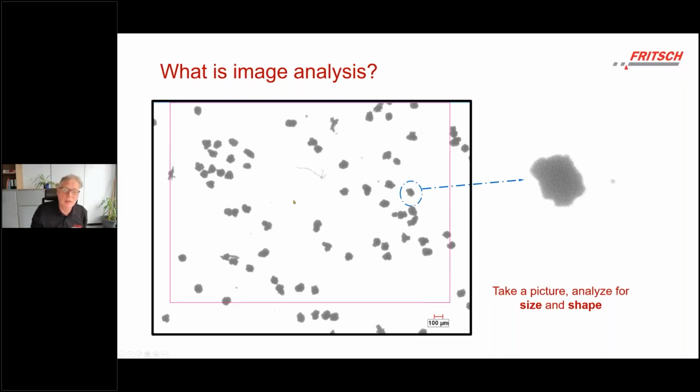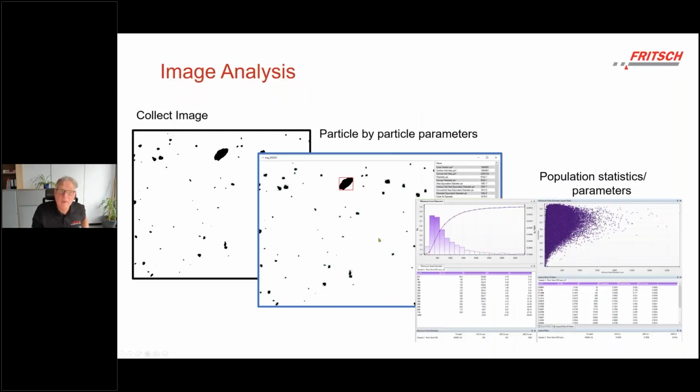You also see one of the things you need to take care when you're running this kind of a measurement. Here the density of particles in the image is rather high, so many particles touch each other. So typically you try to avoid things like that. And so what is typically controlled, of course, by the software of the instrument, so that you don't have too many particles sticking together, what will influence your result.